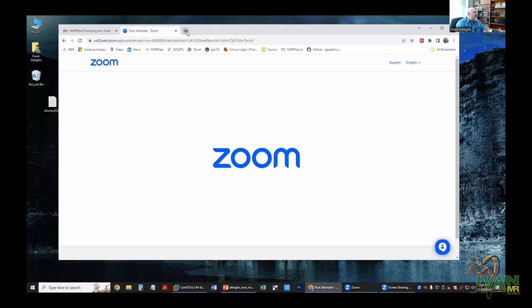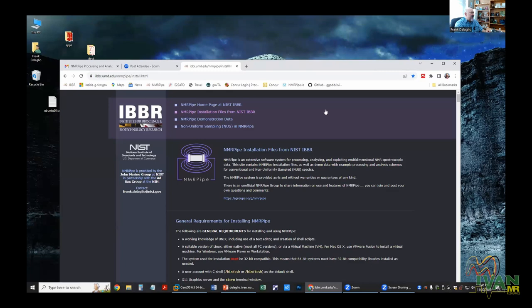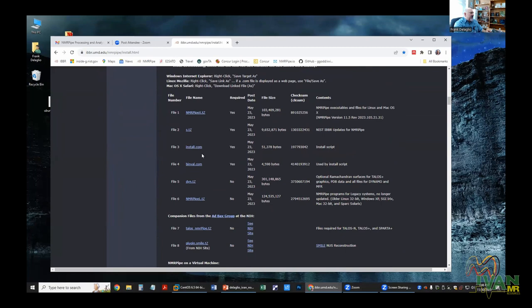Hey, Frank. Is SMILE part of NMRPipe, or do you have to go do those separate installation files? That's a great question. So I will share my screen once more. And let's type NMRPipe install to find the NMRPipe installation page. And over here is a list of the different files that you would download.